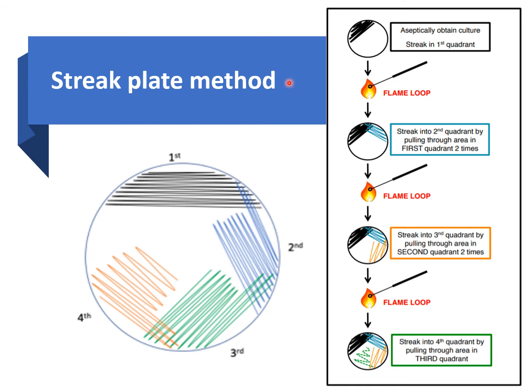Let's go ahead and take a look at the steps together, and then you also have the virtual lab to look at, and there are helpful videos for you. It's going to help you see the steps, okay? And you need to know the steps of the streak plate method and how we achieve that end look that we're going to get right here.